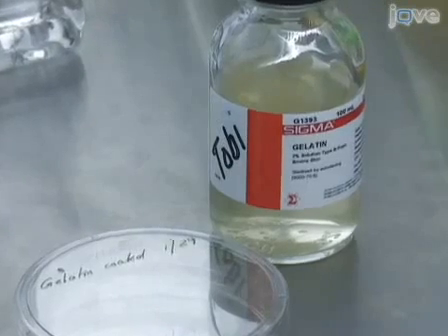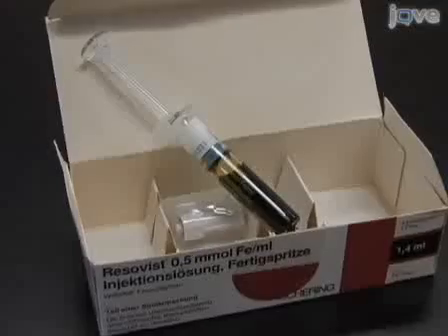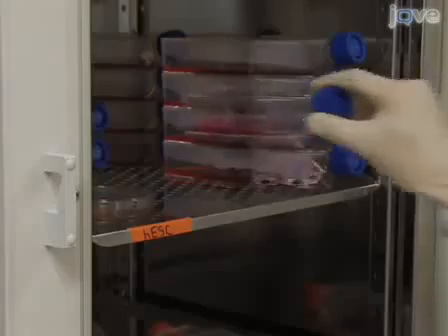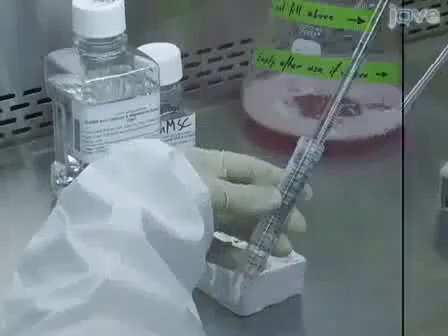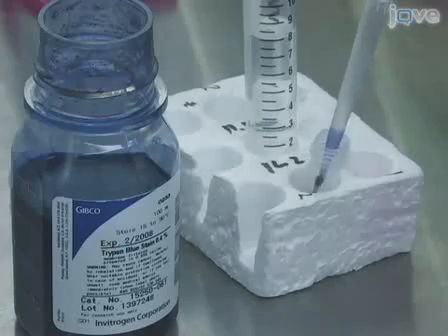The procedures for cell labeling with MR contrast agent vary for embryonic and mesenchymal stem cells, but both techniques involve the following steps. Preparing the cell culture, that is, plating of cells as adherent cell cultures. Preparation of labeling media, labeling of the cells by simple incubation. Trypsinizing of stem cells and washing off free contrast agent. Evaluation of labeling efficiency and cell viability. So let's get started and label some cells.